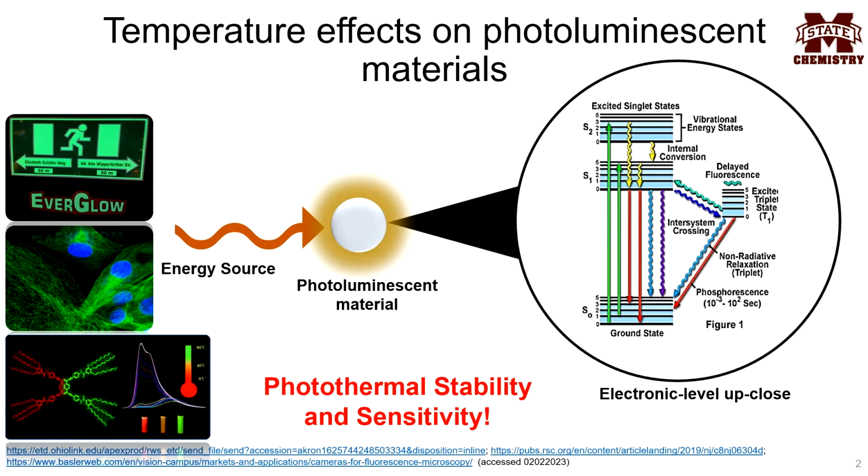Photoluminescent materials have been used in many applications such as photovoltaics, photoluminescent displays, fluorescence thermometry, medical imaging, and many more. To be used in such applications, it is important to pay attention to the thermal stability and thermal sensitivity of the photoluminescent materials.